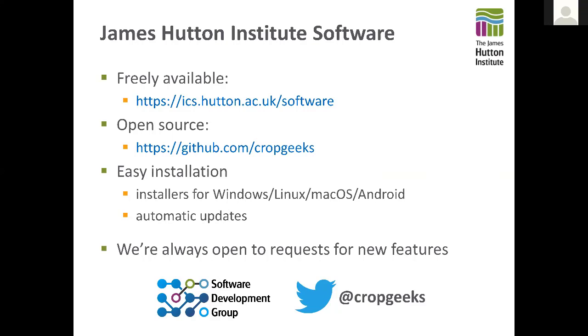By that, do you mean the kind of diagrams and things that Tom Pagan has come up with in terms of how everything interlinks? Yes. Flapjack certainly features in that, as does Germinate. I would assume CurlyWurly does as well, because that's heavily used by Summit. Tablet, like I say, is not really in the plant breeding space, so I wouldn't really see that fitting in there.